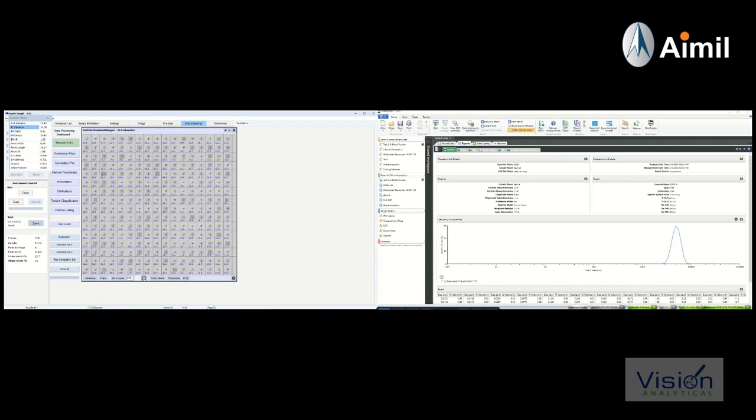And the fact that they were using two techniques, sieving and laser diffraction, they could not see these small particles. This is why their viscosity was a bit irregular, and it's because they couldn't see these small particles. Therefore, a number weighted technique such as dynamic image analysis is a great complement for laser diffraction.